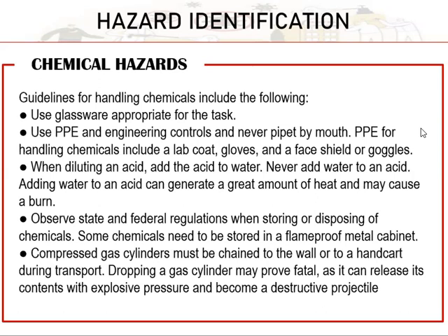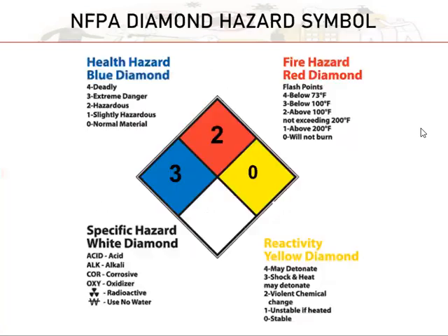And proper disposal, proper storage of chemicals must be observed, and kana mga flame-proof metal cabinet. So dapat na yun na siya ideal na kinsa lang dapat ang tapad ani na chemical. Kinaay mga chemicals class, even though they are placed in the containers, pag itapad nimo siya to those chemicals na dili dapat, it can result to explosion. Okay? So kindly check as well in your book the hazards in connection with this one sa page 35, chapter 2 in your book.